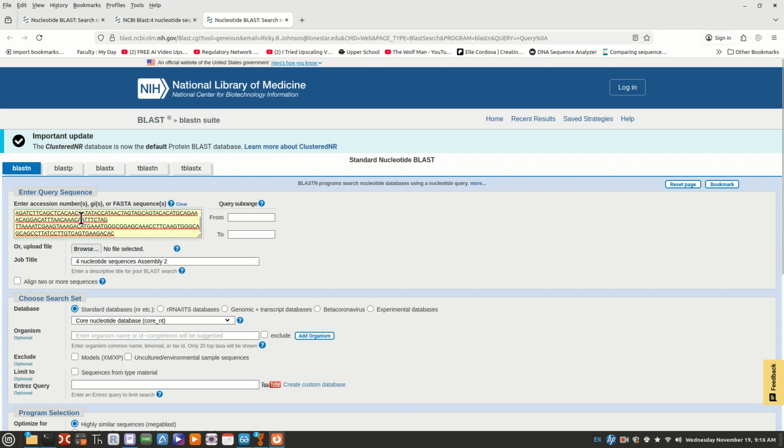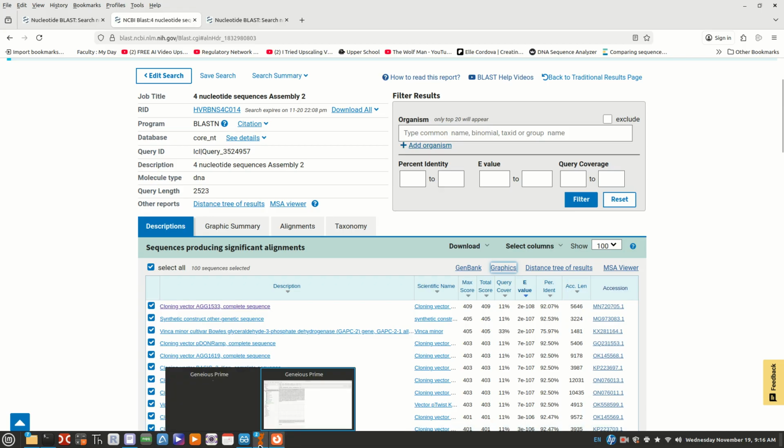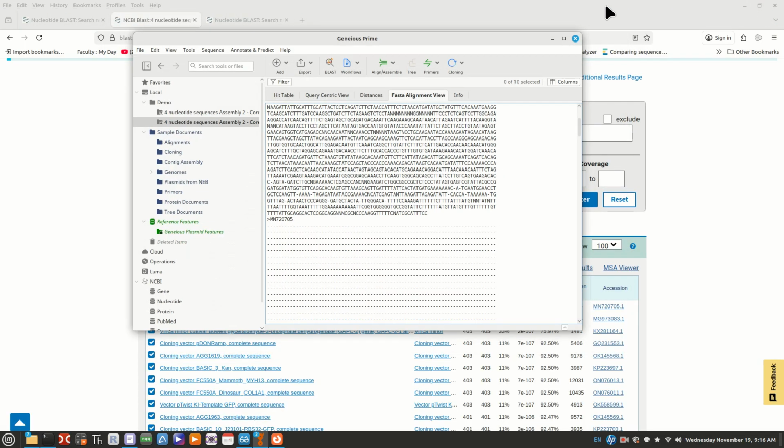I've put it into Blast here. If you're not familiar with Blast, Geneious opened this up for us. You can click on the place I clicked, which was where I have to click this, and then it was the second tab. I don't want to click on it again because it'll do it. So go back and watch this again where I clicked. And what it'll do is it'll open up Blast for you.